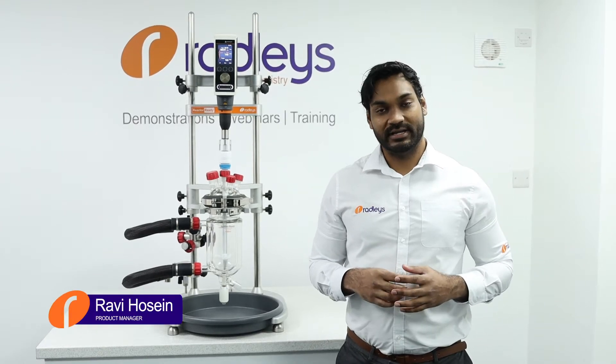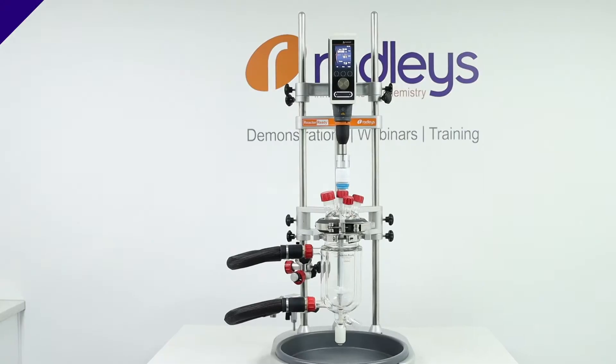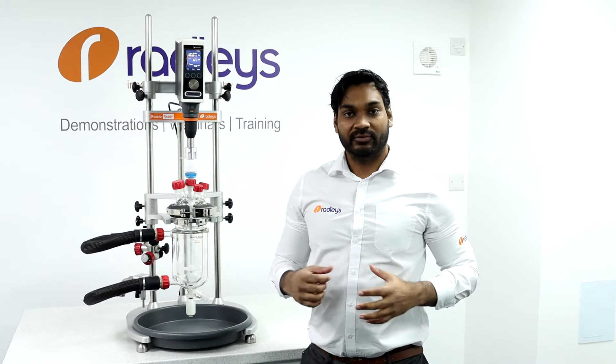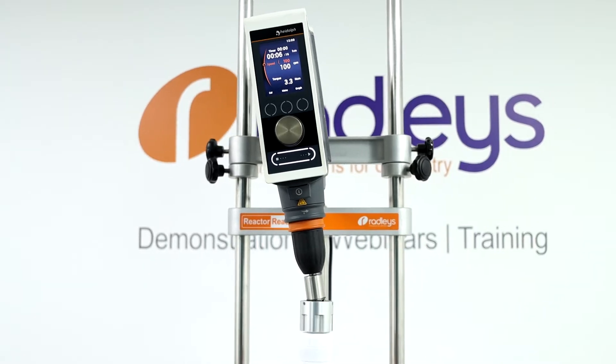Today I'm going to show you how to align an overhead stirrer on a Reactor Ready Jacketed Lab Reactor System. Reactor Ready features a patented drop-in coupling that will work even when the stirrer is misaligned.